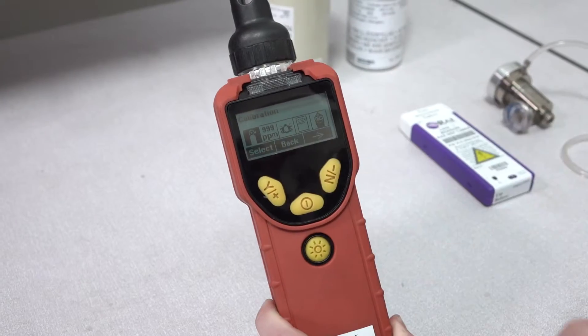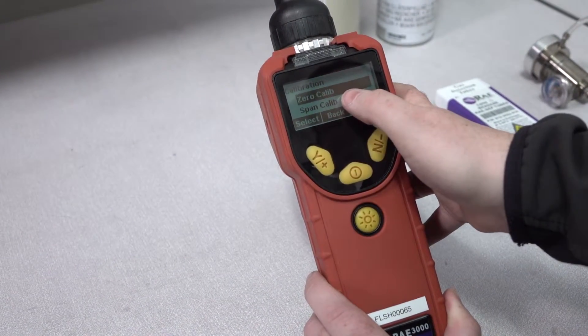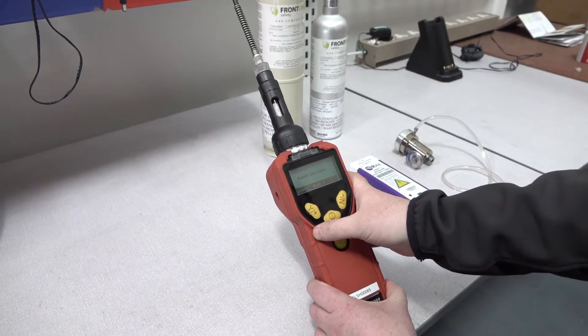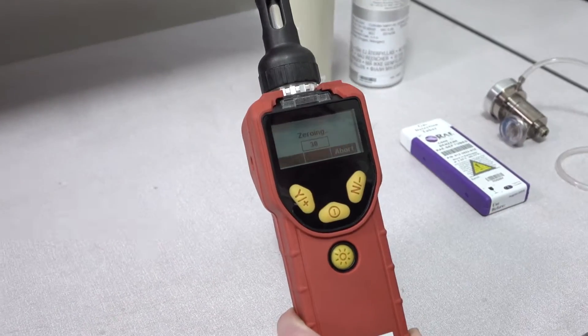Once you're in the calibration menu you'll see that you have two choices: zero calibration and span calibration. We're going to choose zero calibration, and making sure you're in a fresh air environment, press yes.